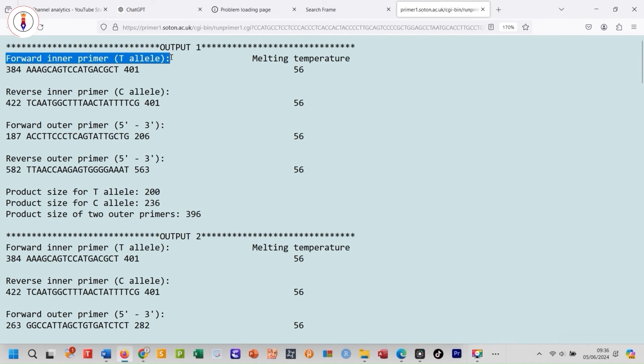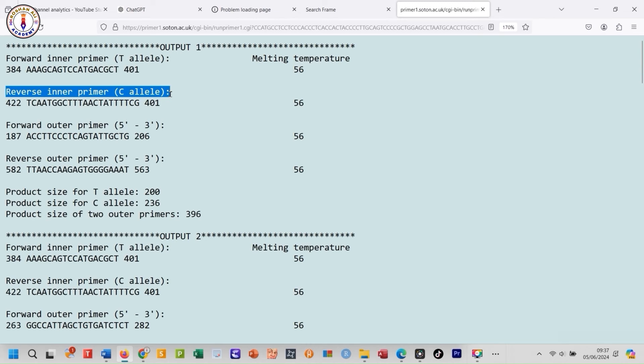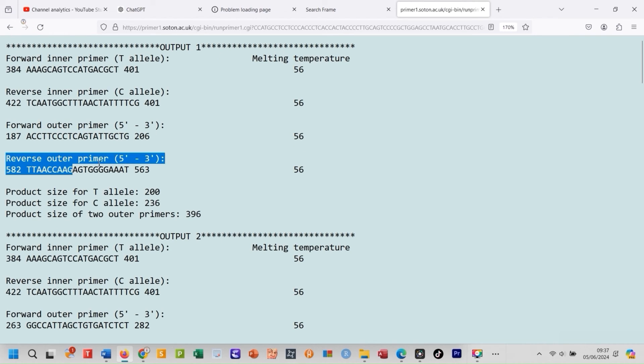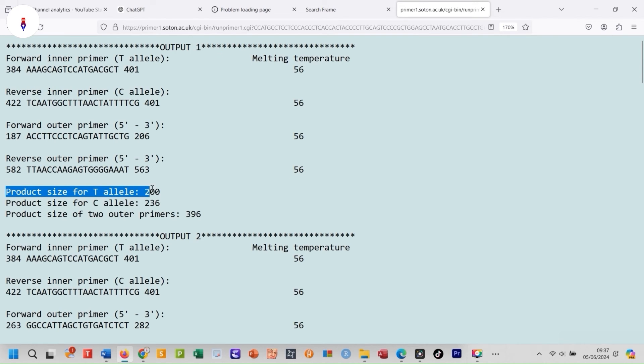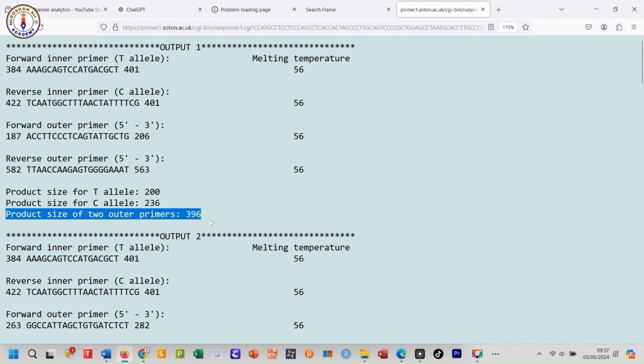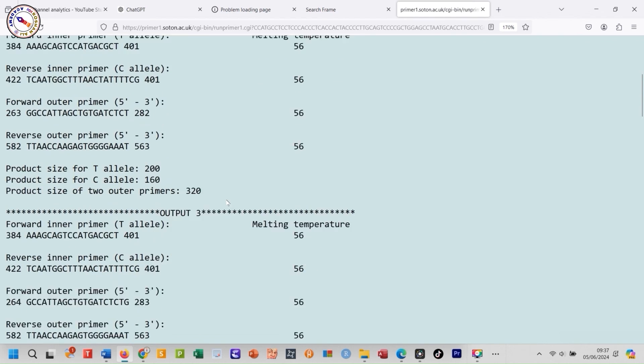Here are your primers. This is the forward inner primer with its melting temperature. Here is the reverse inner primer sequence. This one is the forward outer primer, and this one is the reverse outer primer. These values are important for identifying the allele in your sample. If your band appears on the gel at this position, it means you have the T allele. If your band appears at this position, then you have the C allele. This is the product size of the outer primers, which confirms that the desired DNA is present in the sample. Primer1 not only creates one pair of Tetra Arms PCR primers, but generates a list of primer pairs — pair one, pair two, pair three, and so on.